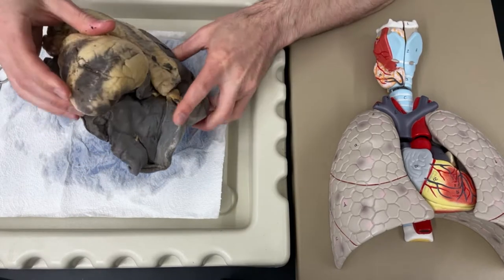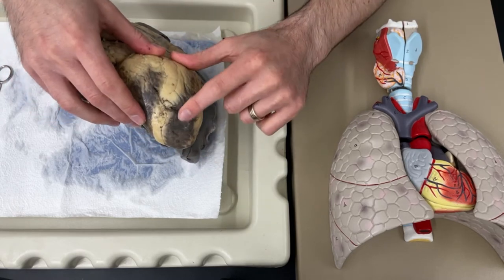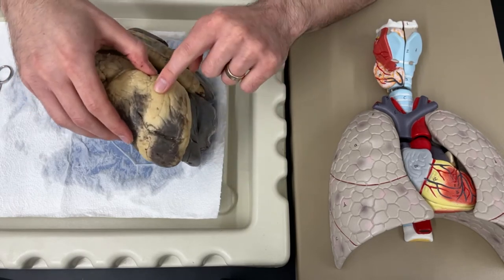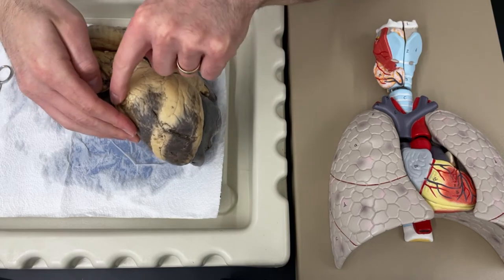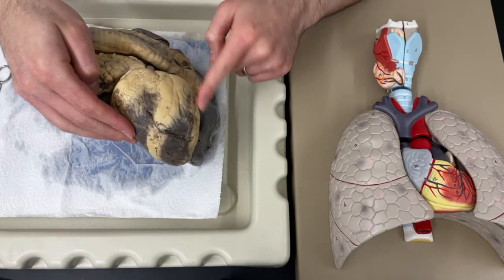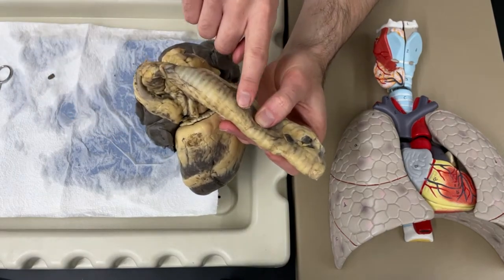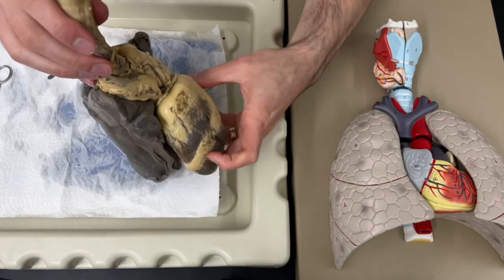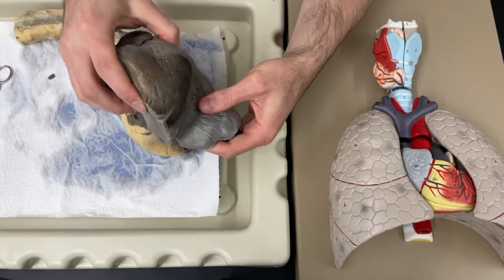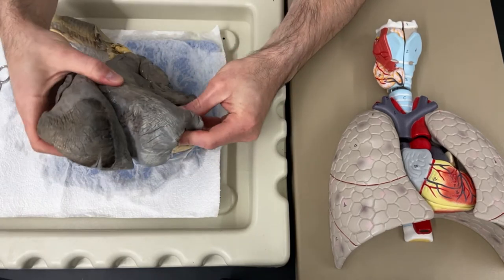I'm going to turn this over, and one thing I should be able to find is the heart. The heart is here - you should see some dark tissue as well as this lighter fat tissue around the heart. That fat is covering the different parts of the heart. You should also be able to find the trachea, which is going to have these ridges or rings traveling up it. And then the lungs are going to be these kind of dark, big sections that have these different lumpy lobes.